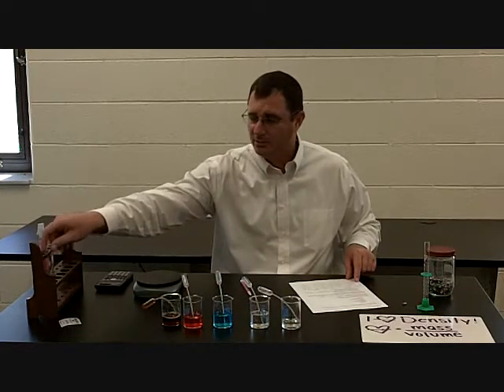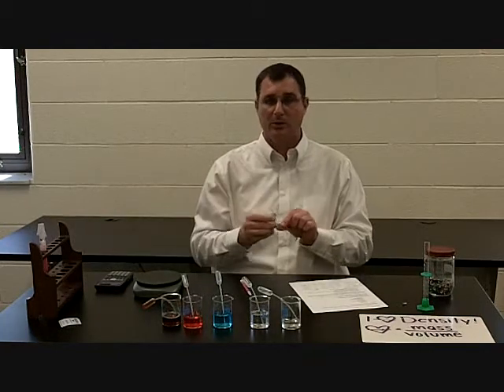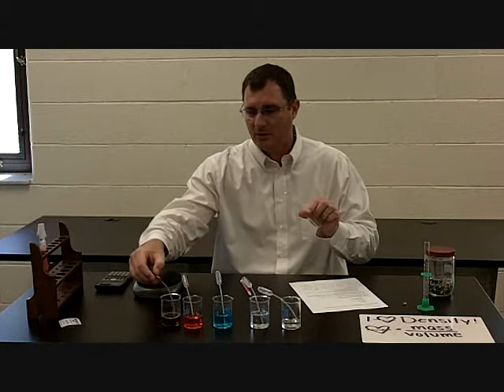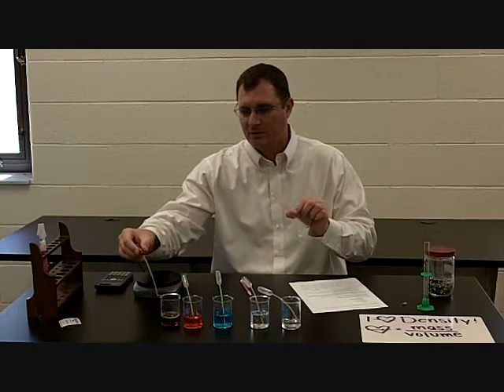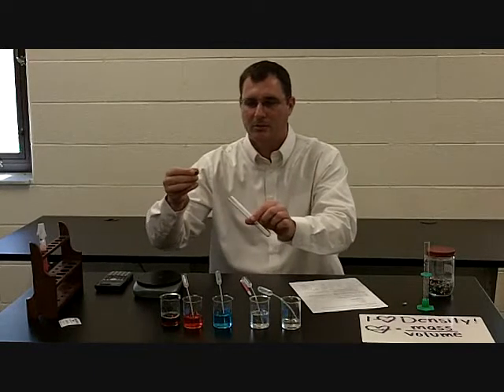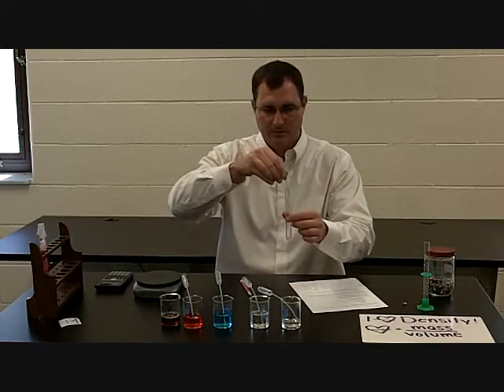I'm going to grab a test tube here, and I'm going to try to put these fluids in here. I'm going to put them slowly. I'm going to tip the tube sideways so they don't ruffle each other. And I'm going to see if these things can stack on top of each other and not mix too much. So let's start with the maple syrup.